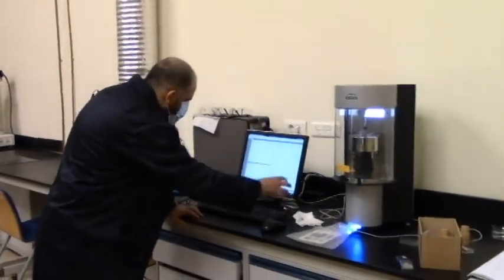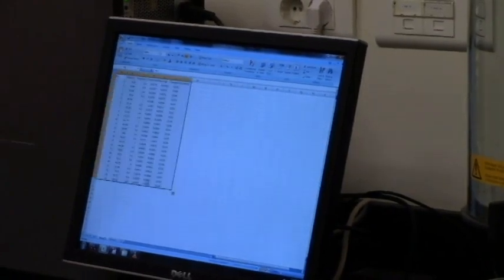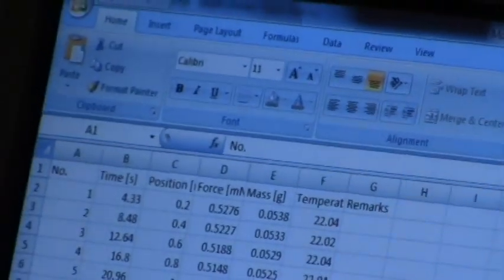As you've seen, this is a straight line that the software gives us. Again, we'll copy all of this to our Excel sheet. We'll go to this second sheet and call it WL for wetted length.